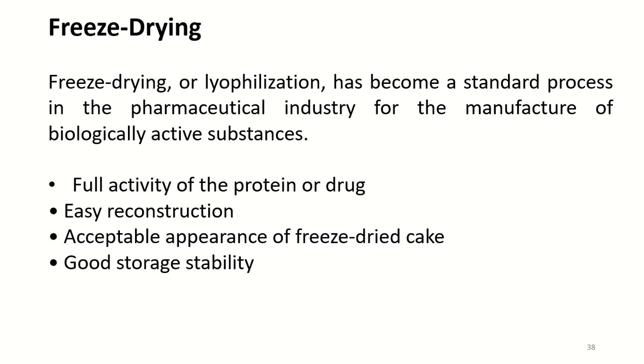Here is the freeze drying. Freeze drying or lyophilization has become a standard process in the pharmaceutical industry for the manufacture of biologically active substances.